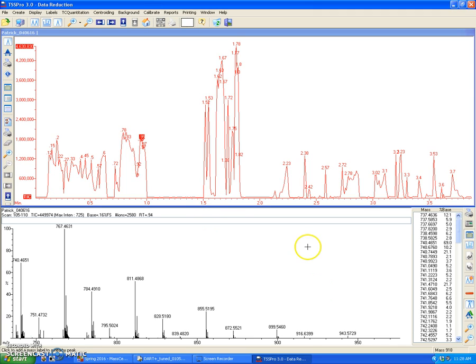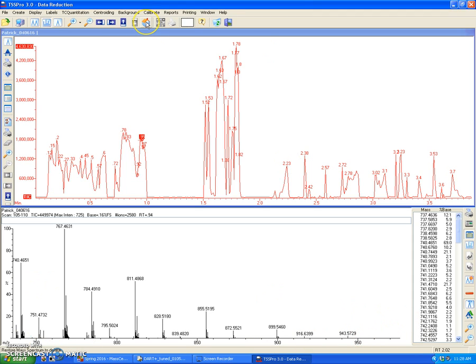You can see that I'm zoomed into this mass spectrum region, so I just can zoom out by clicking the home button, and I'm back to where I started.